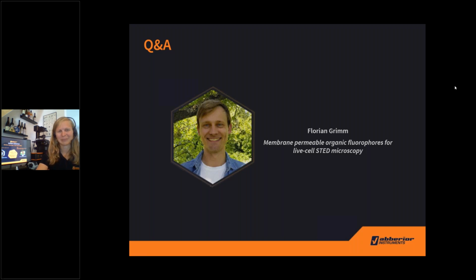Martin and Isabel will now show you how to acquire live cell STED images on our facility line microscope. Isabel and Martin, I'm really looking forward to your presentation. The stage is yours.